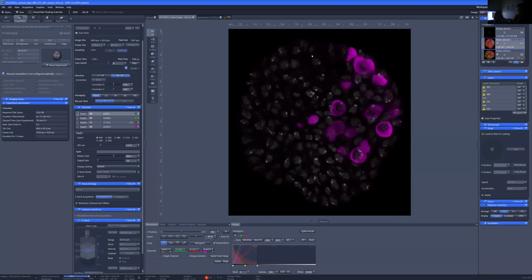Yes. So this program doesn't rely on artificial intelligence. But what basically, and this gets into a lot of the computer science that I don't quite understand, essentially artificial intelligence can help train programs called neural networks that can do these types of identifications and learn how to identify objects much better. And so one possibility that my collaborator and I have talked about is adapting this program to actually use a neural network and artificial intelligence to accomplish this process much faster and much better.